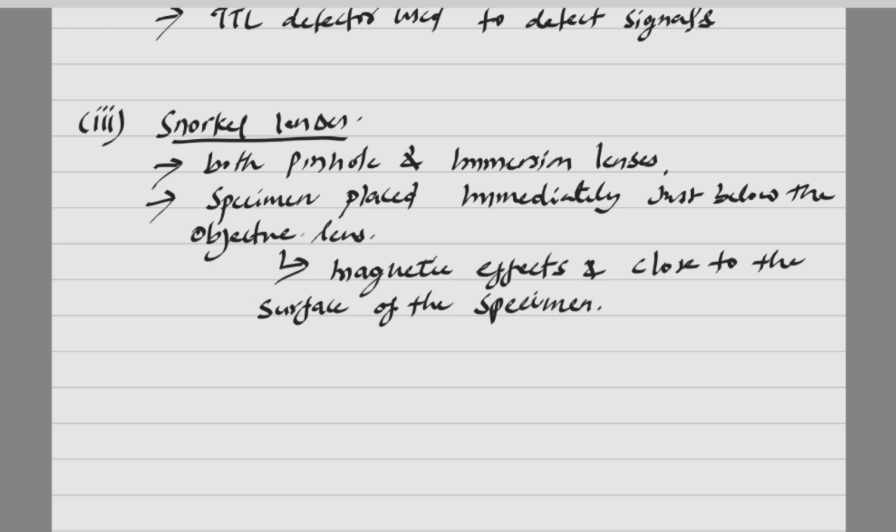The relative placement of the sample is such that the magnetic field of the lens extends to the surface of the specimen. This design combines both pinhole and immersion type lenses.